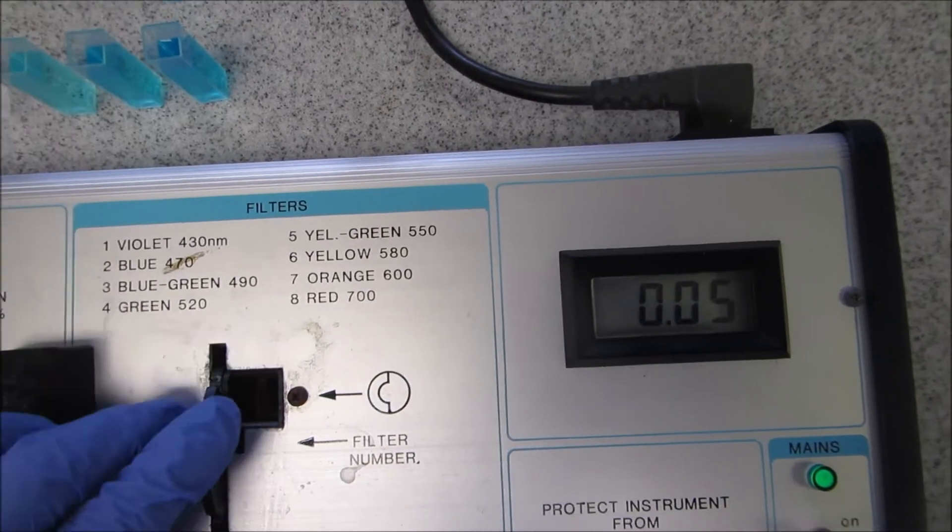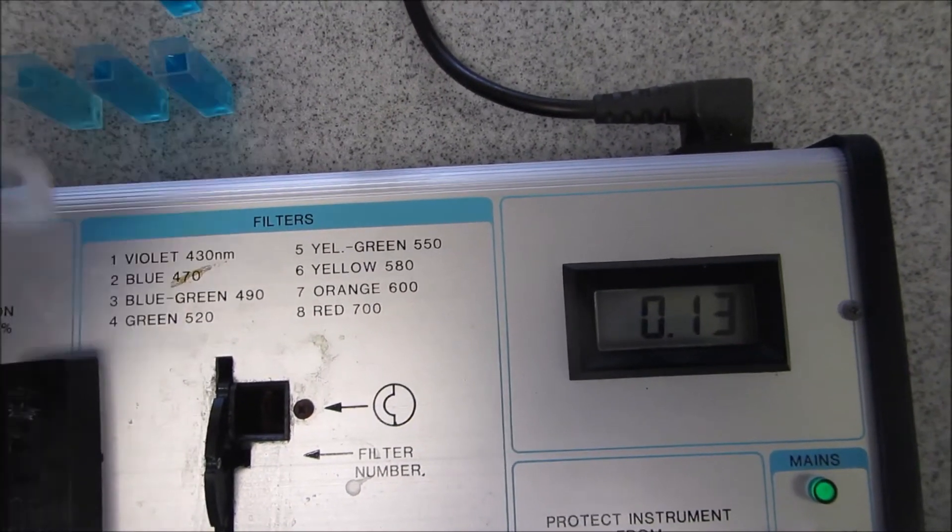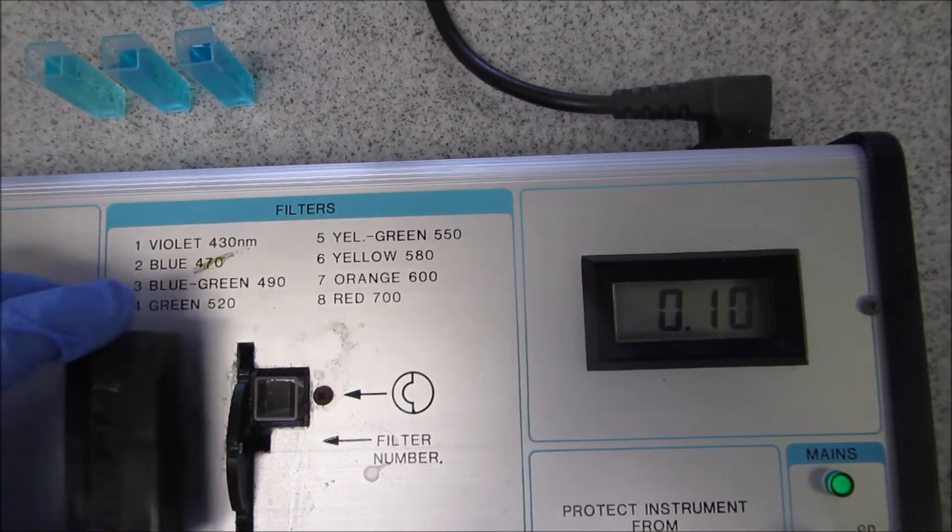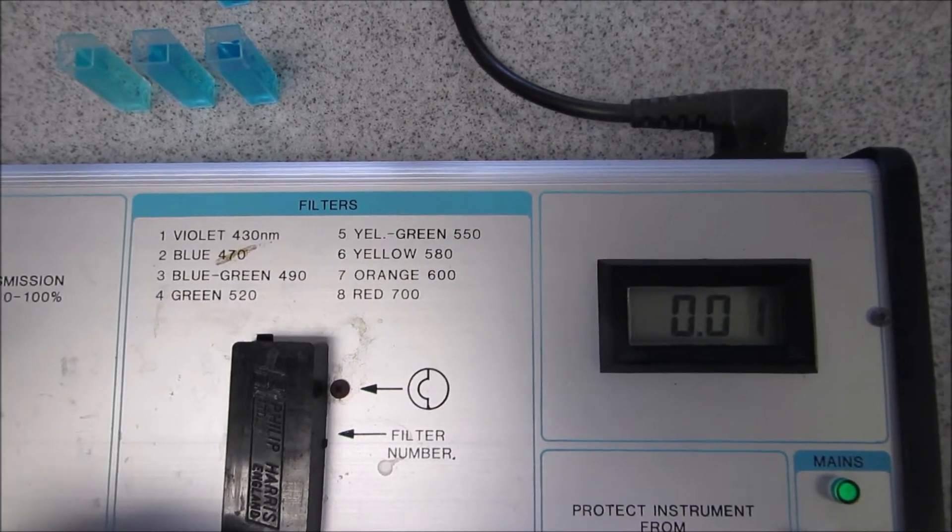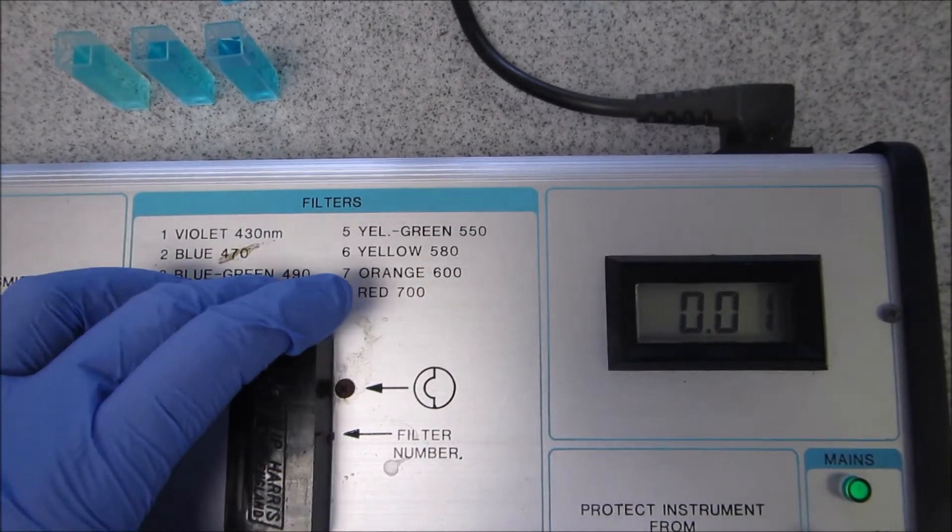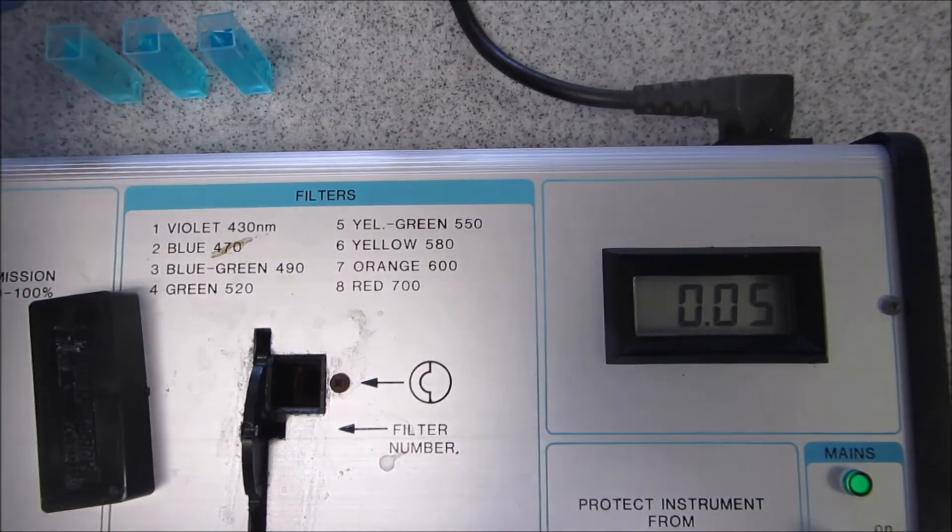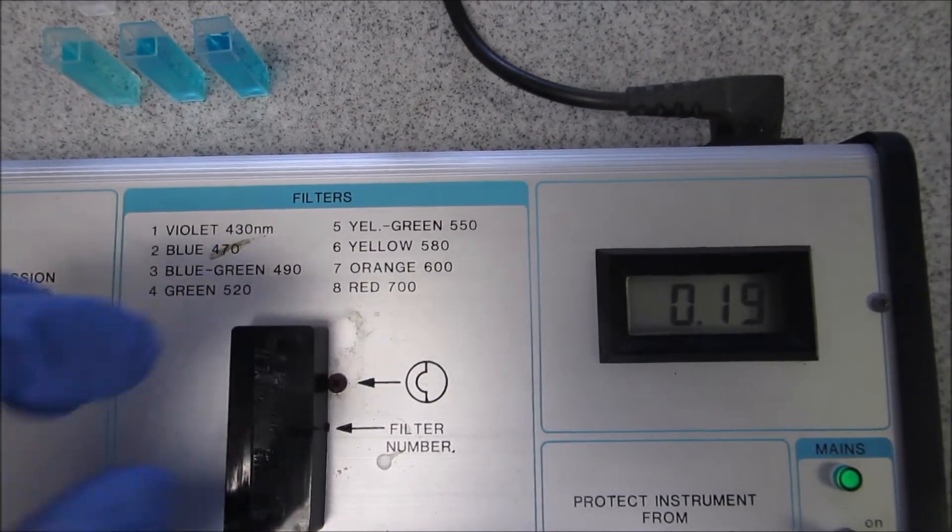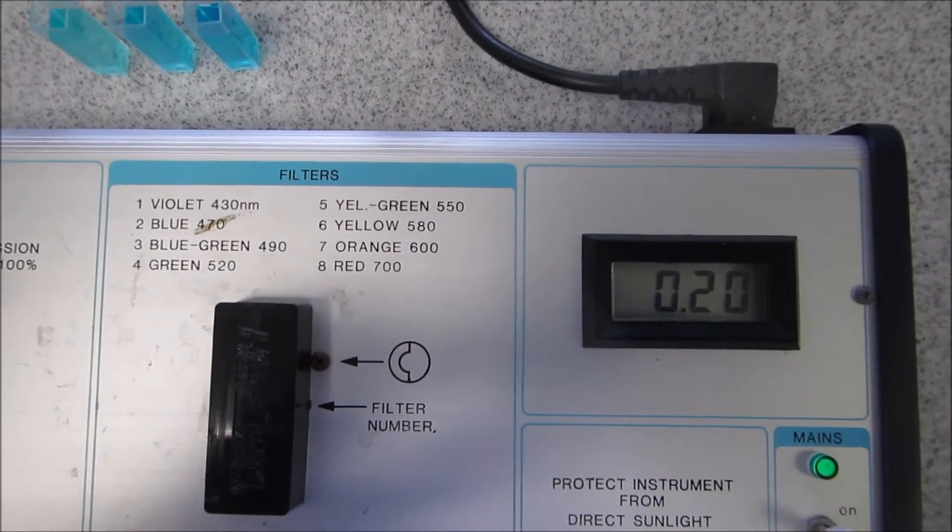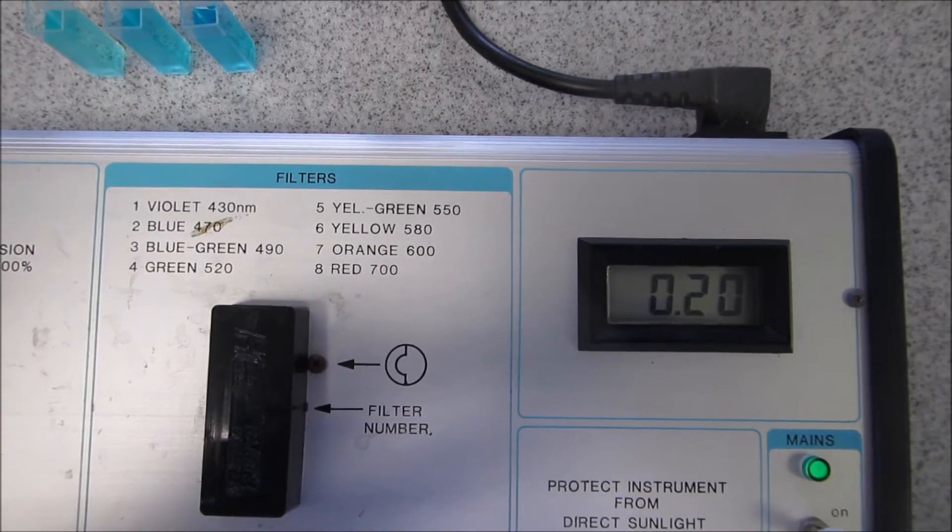I'm now going to change it to number 5 which is 550 nanometers, put in my blank, zero it, and now put back in my 1 molar solution. You can see the reading for that.